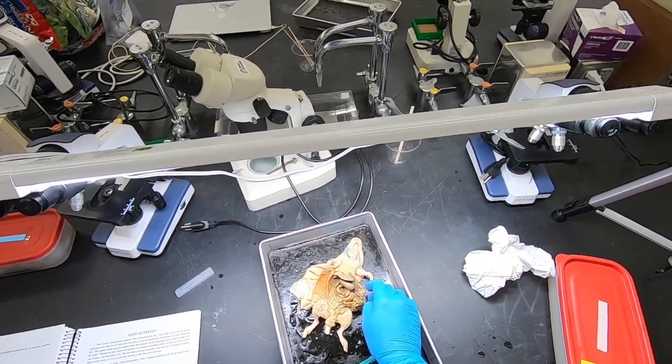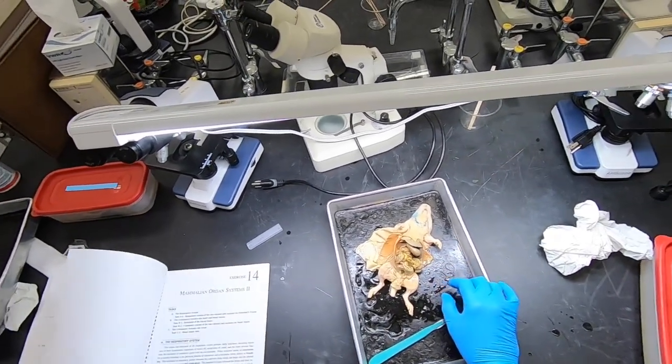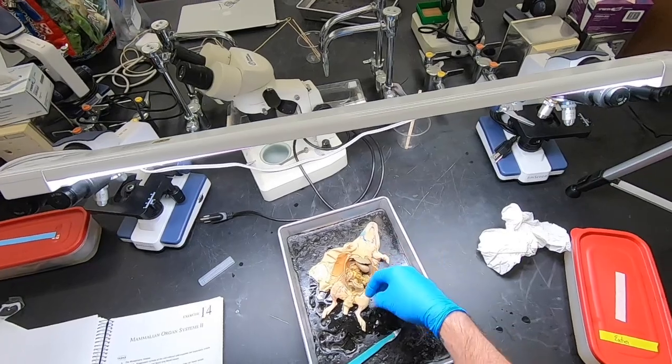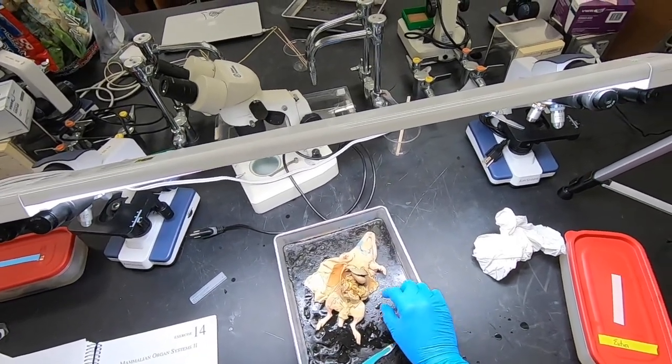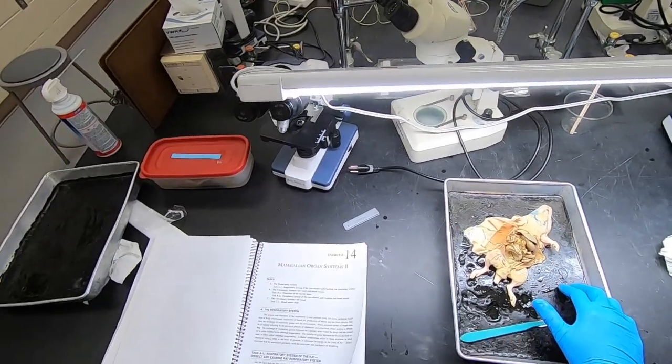The duodenum is part of the small intestine. The small intestine feeds to the cecum and then to the large intestine, and once the food is done in the large intestine, it's going to leave through the anus.